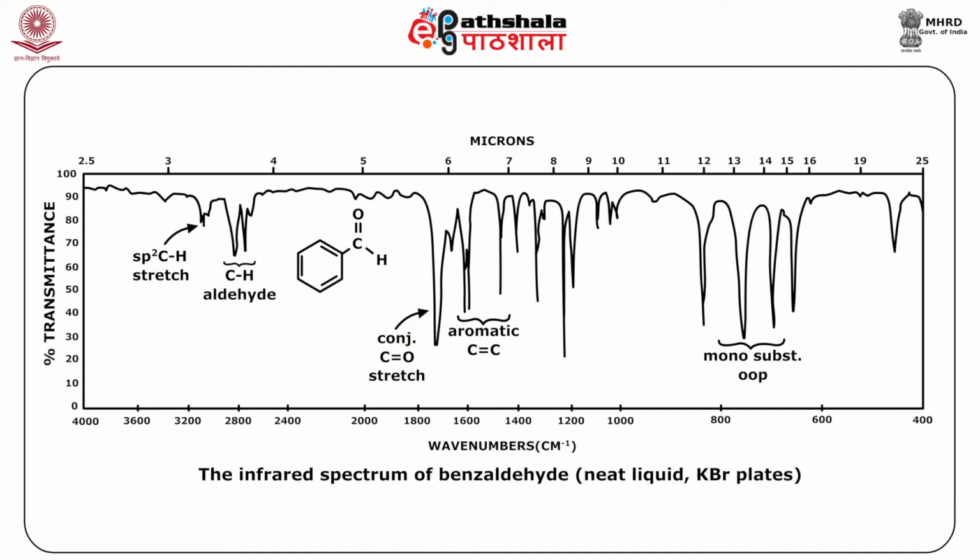Now the aldehyde C-H stretching vibrations appear as a pair of weak bands between 2860 to 2800 cm⁻¹ and 2760 to 2700 cm⁻¹.